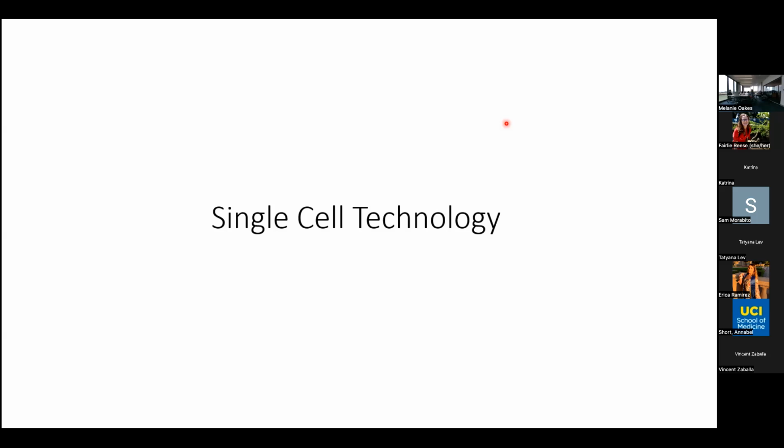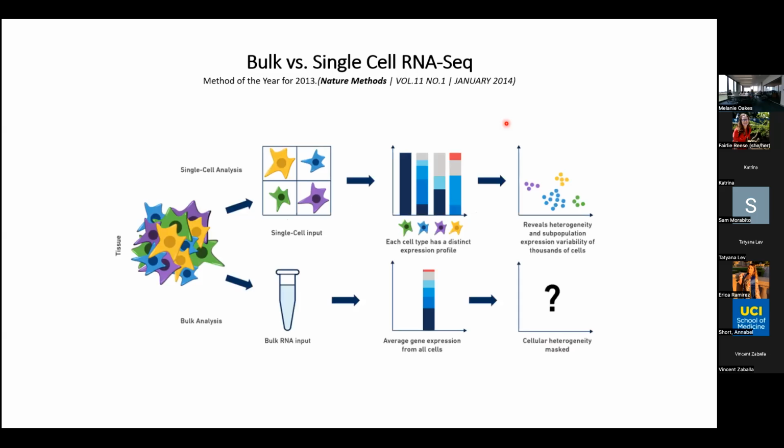Okay, shall we talk about single cell? How's our time? Oh, you're fine. Okay, so here's my next show and tell. Most of you know that what we need to do for single cell is get rid of noise. The idea being that if we can look at the transcriptome of a single cell, then we're getting more information.